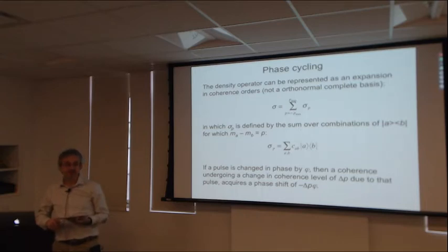Now I shift the phase of the pulse from X to minus X, the phase of the magnetization after the pulse is going to be IY. And if I want the signal to accumulate, I have to shift the phase of the receiver by 180 degrees, i.e. I have to subtract those two signals. If I don't do anything to the receiver, the two signals are going to null.